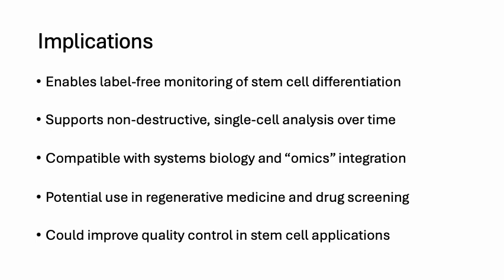In the article, the authors hint at synergy with systems biology approaches, and they note that measuring real-time biochemical signals can complement gene expression or epigenetic data. And this synergy would sharpen our understanding of how specific molecular events, like changes in histone marks, manifest as shifts in Raman peaks.